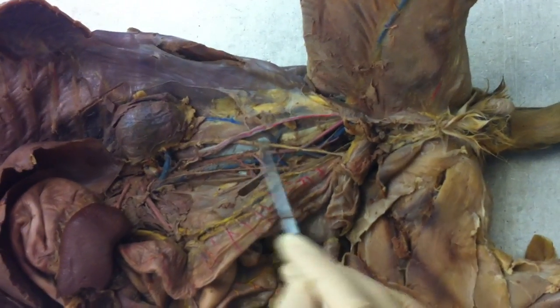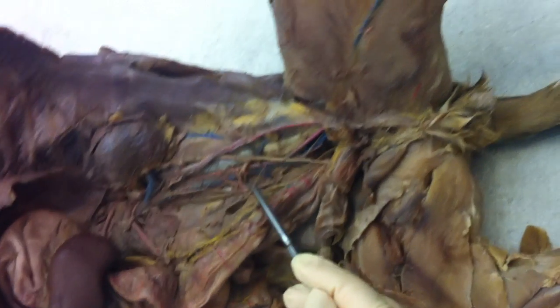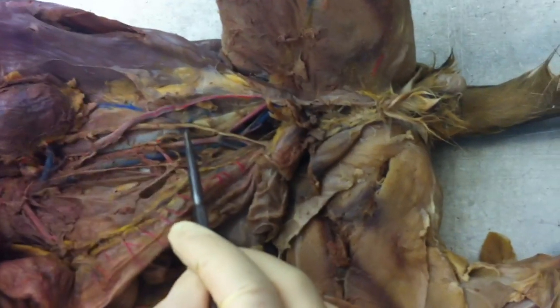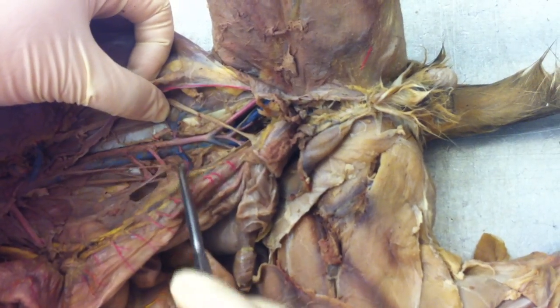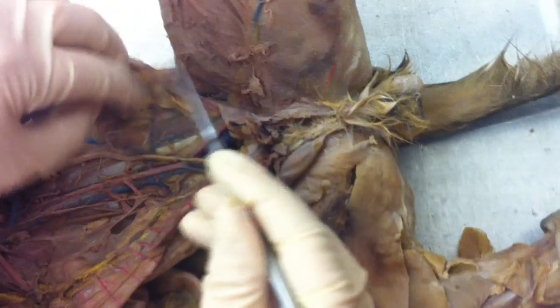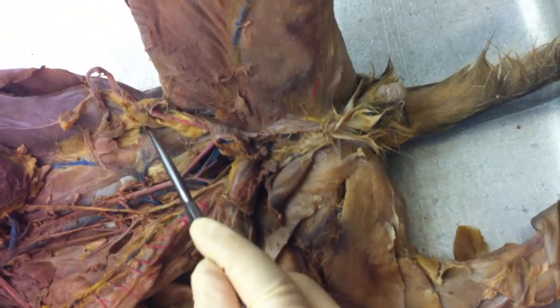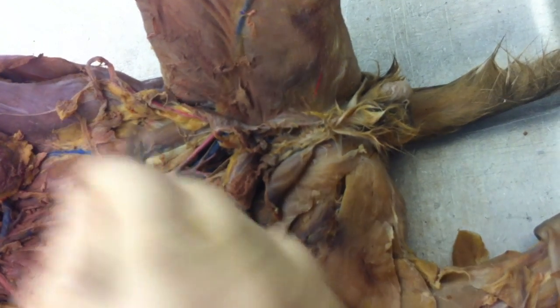Going back to our dorsal descending aorta, what's our next stop? Well, it's the one we've already visited. It's that inferior mesenteric, right? Just south of those are these ones that come off the sides and look like, let's see if we can figure out where they're going. It looks like they're going nowhere, doesn't it? They're just like, meh, done. Those are going to go deep.